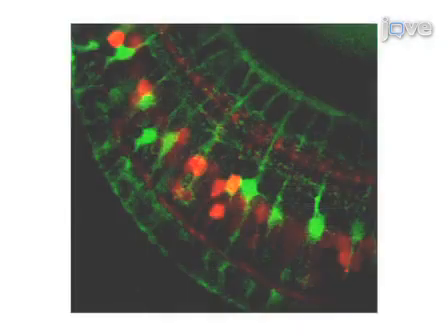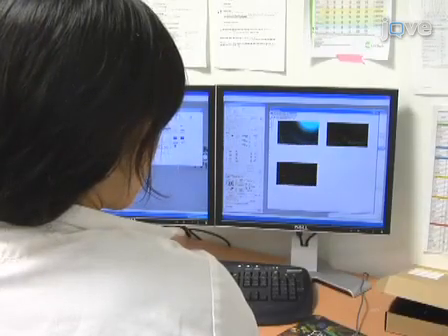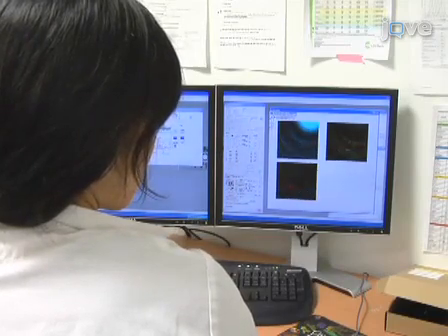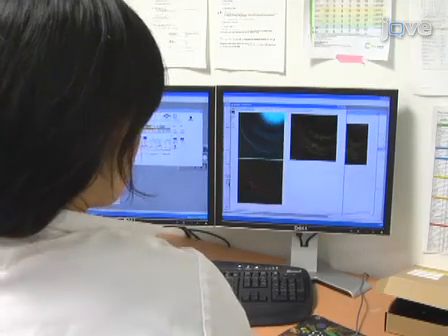The time-lapse imaging techniques described in this video have been used to monitor GFP-labeled retinal stem cells during the ablation and regeneration of retinal bipolar neurons. To perform spectral separation, collect images using sequential imaging modes and variable barrier filter settings, which allow overlapping fluorophores to be acquired independently and partially separated respectively.